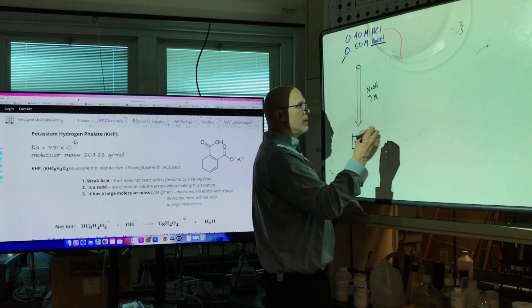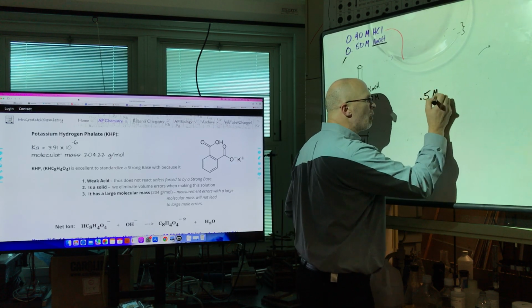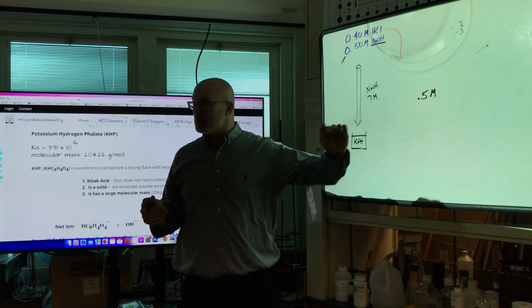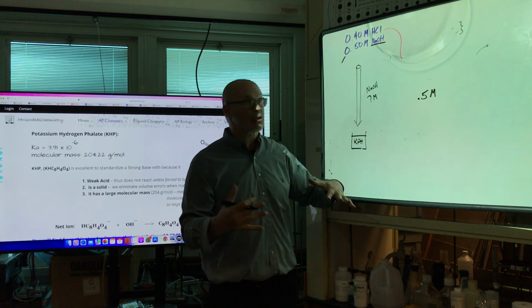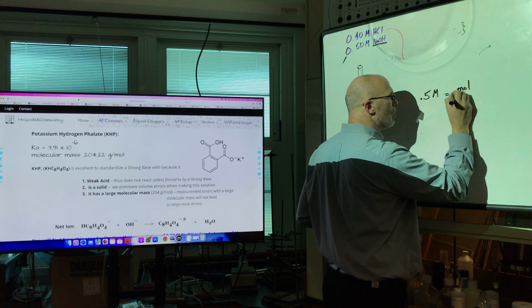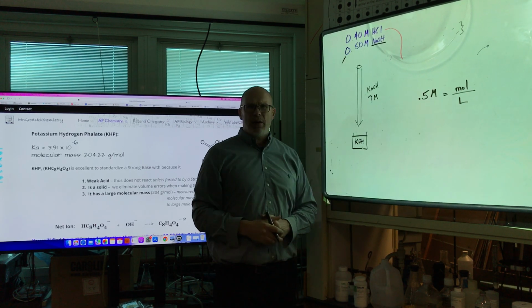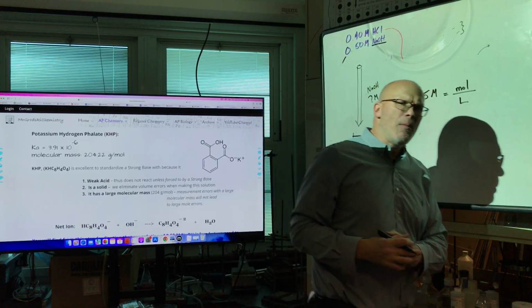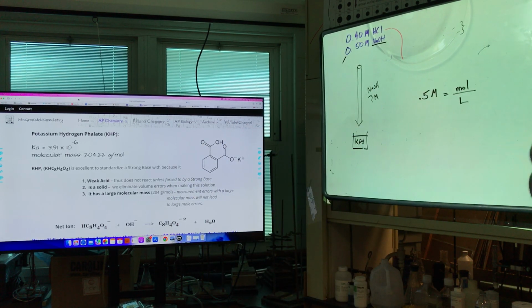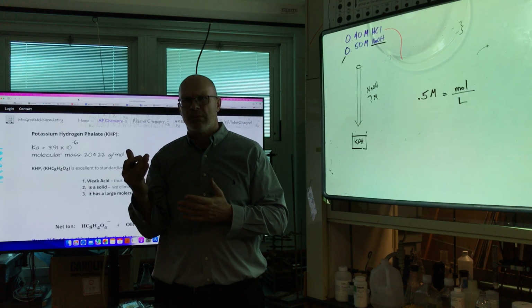Well, here's what we know. It's about 0.5 molar, correct? That's my target. I know it's a little bit less. I don't know how much, but we're just setting up the titration. It's 0.5 molar, which equals what? Moles over liters. Now, here's my question. How much base do you want to deliver to get to the endpoint?